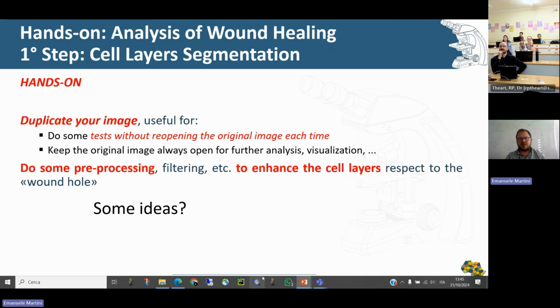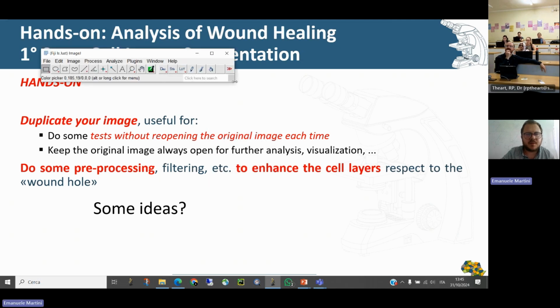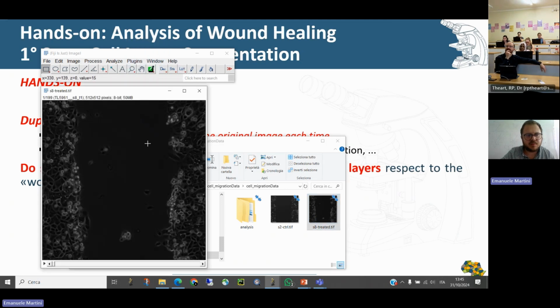Okay, so now we will try to do a little bit of hands-on. I will see how far we can go doing things together, and if it takes too long, I will go by myself. But we will start, I think 40 minutes will be okay for us. So you can open your Fiji if you have it. For me, it's taking one year. Okay, it has opened. And then you can open the S8 image. So S8 treated should be like that.